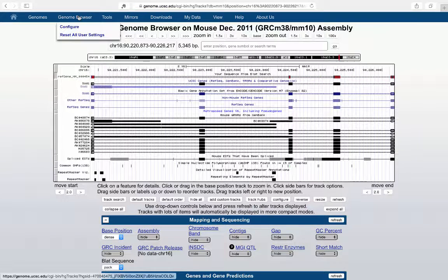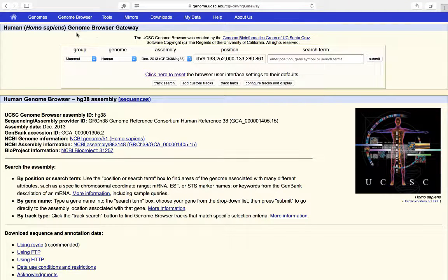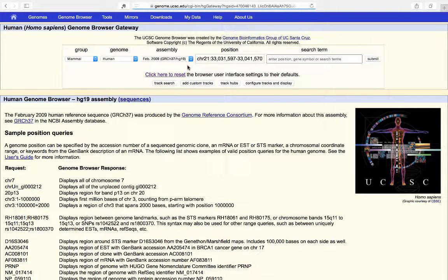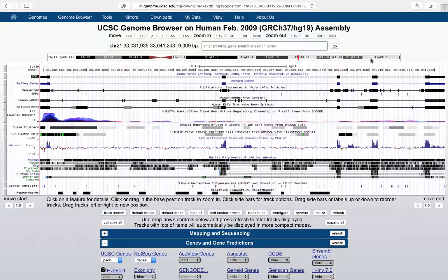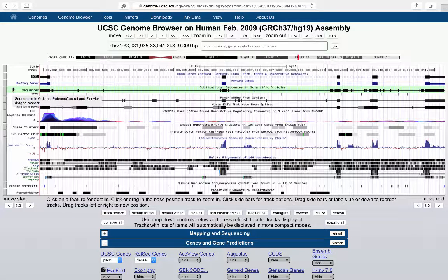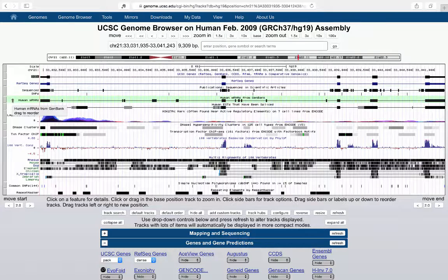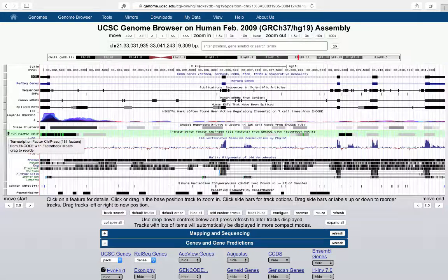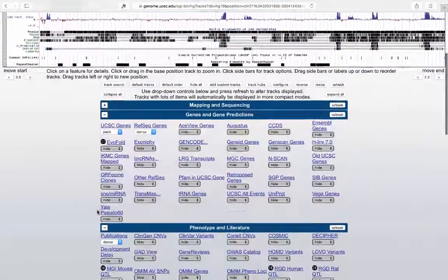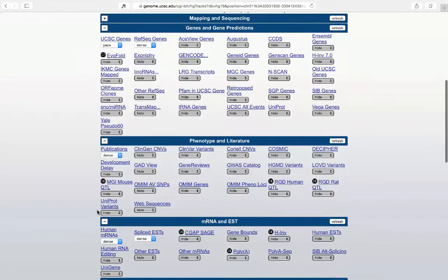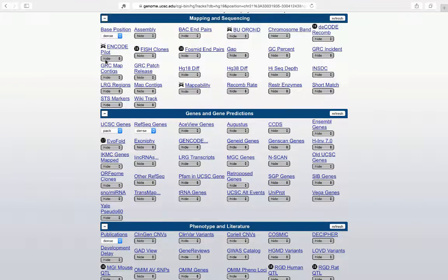Going back to the gateway page, let's look briefly at HG19, still the most widely used default assembly. Selecting it and navigating to the SOD1 position, you immediately notice more annotation and data tracks in HG19 than in HG38 by default, because there's much more data available. Extra tracks include publications linking sequences to scientific articles, human ESTs, and an extra transcription factor ChIP-seq data track.